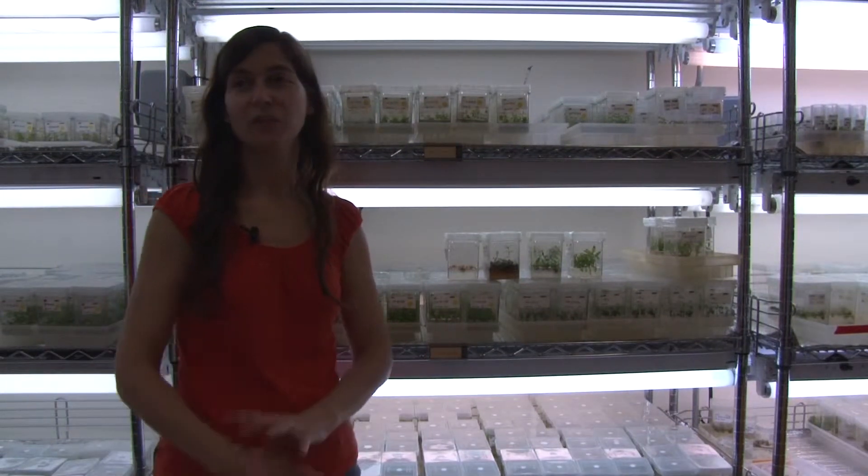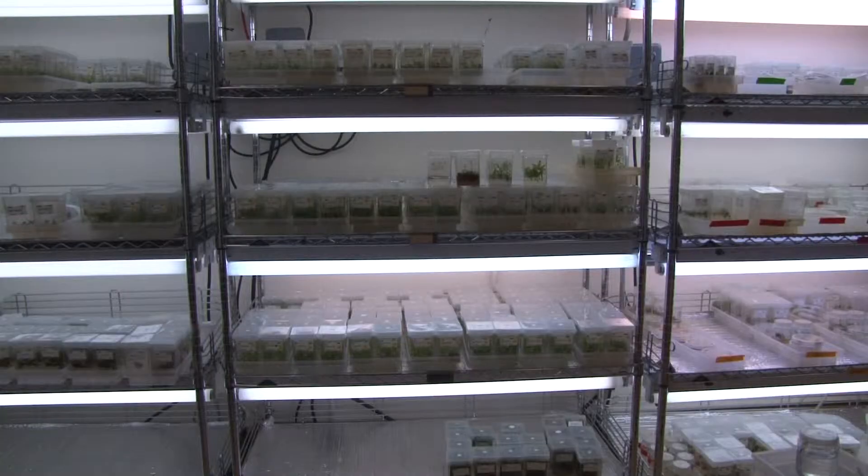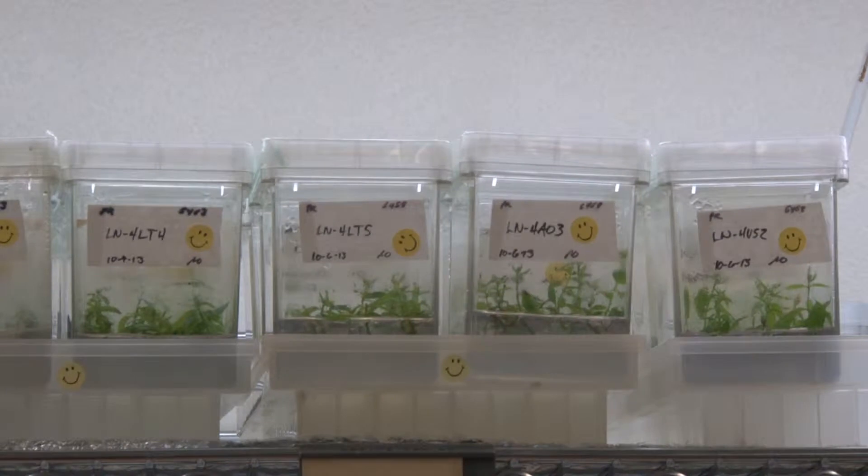What I've been working on is transforming American chestnuts. Linda McGuigan is working with professors William Powell and Charles Maynard at SUNY ESF to revive the American chestnut tree.